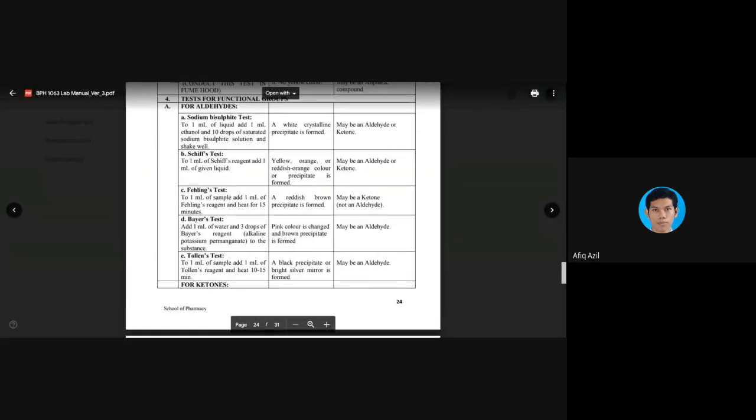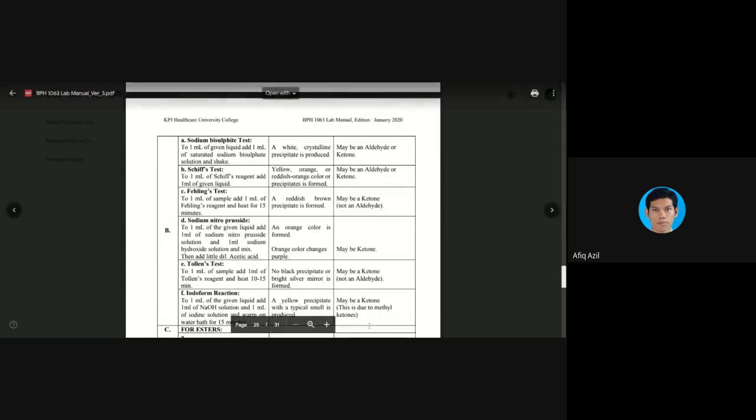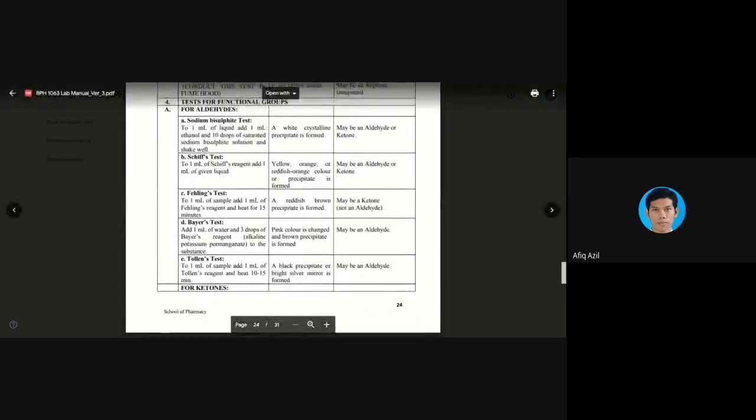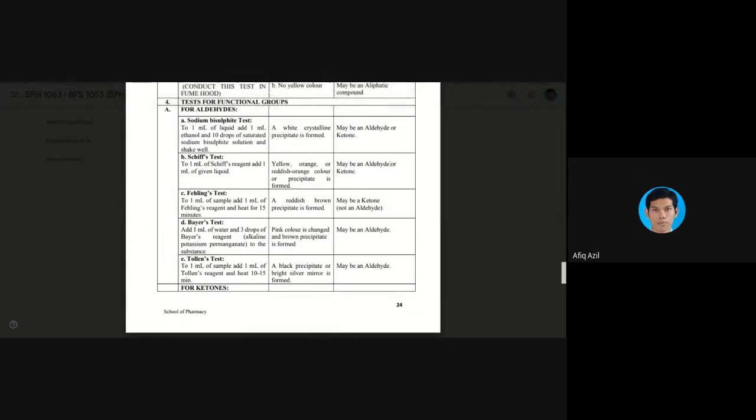that kind of observation occurred, that means first you can try to redo the test. For example, the one test that might give positive, for example, the Tollens test. So redo it again. Because you might have done it wrongly the first time, but if it still persists giving you positive, okay, leave it, and then repeat the other test that gives a negative observation for ketone, for example.